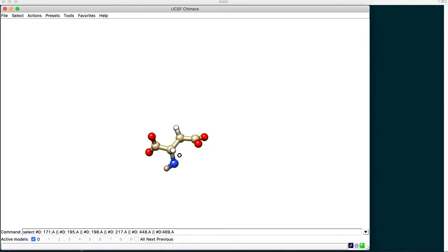So what we are going to do here is first we'll save this structure alongside the receptor. I'll just show you in a minute that the receptor still exists. So now that we have this chunk of the molecule attached to the receptor with the adenosine monophosphate group gone, we actually have now L-Asp, that is L-aspartic acid, attached to aspartyl-tRNA-synthetase.